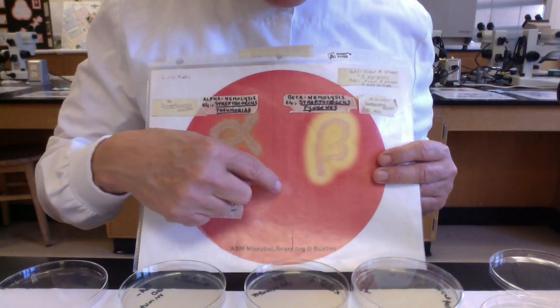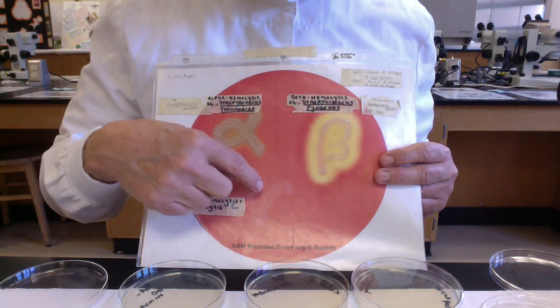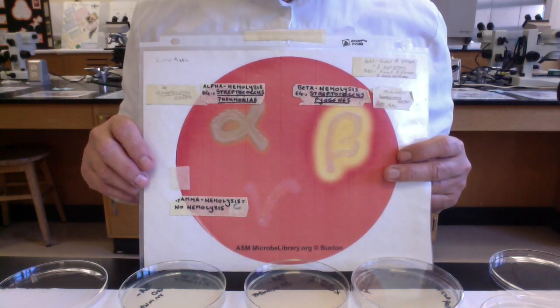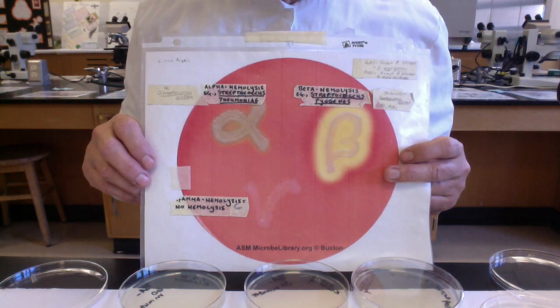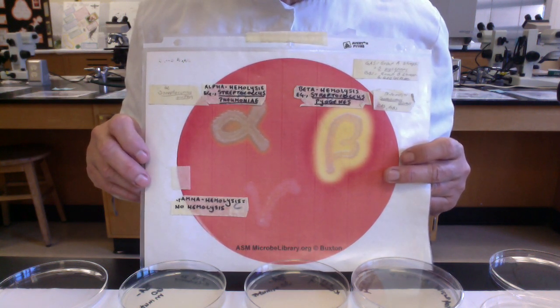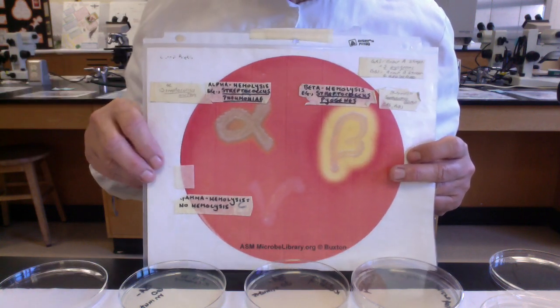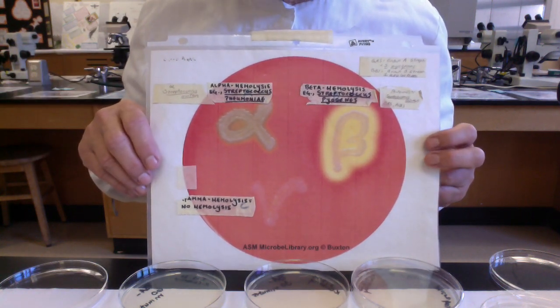And then down here, this is really hard to see. This is called gamma hemolysis, and it's no hemolysis. Why they had to call it gamma hemolysis, I don't know. But most microbes are going to be gamma hemolytic. Being able to do alpha or beta hemolysis is rather unusual in the microbial world.